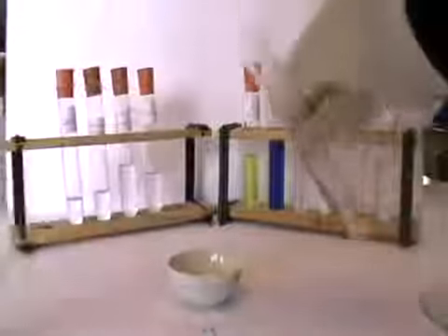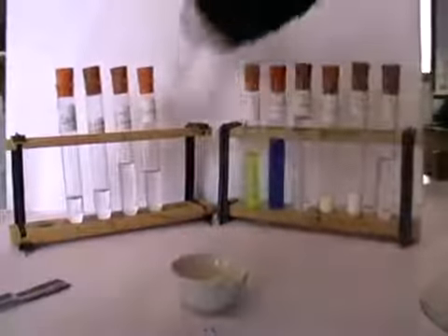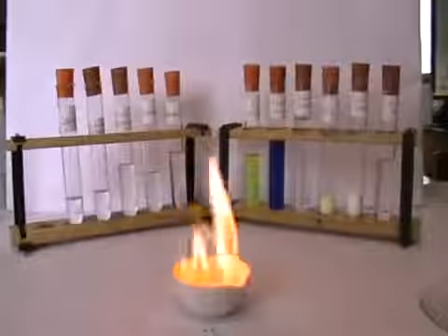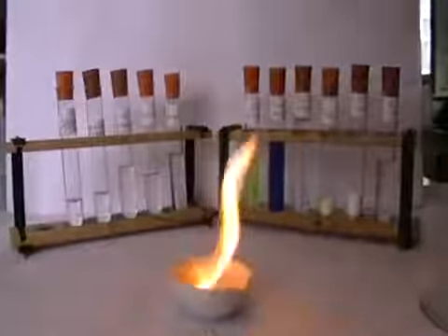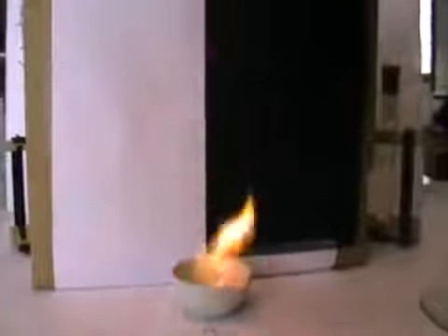So let's pour a little bit of propanone out into the dish. Just a few drops. And using a lighted splint again, immediately you can see the propanone catches fire. Burning again with quite a clean flame, little sign of any black smoke or soot, and just a little bit of black deposit on the inside of the dish, indicating some unburnt carbon or soot.